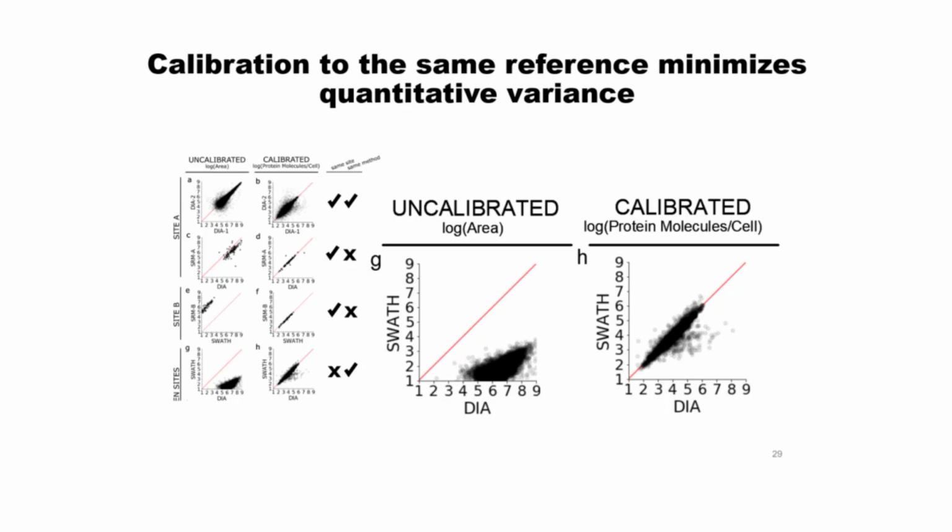Sorry, you use that reference for sample prep and also for the instrument itself? Yep. Yeah, so there's 11 measurements now. So there was 10 samples, you have 1 reference, all the values are expressed as a relative measurement relative to that common external reference. It's like having an 11th bridge channel, as people call it for TMT, but because we're doing it all as separate runs, there is just an extra 11th run.